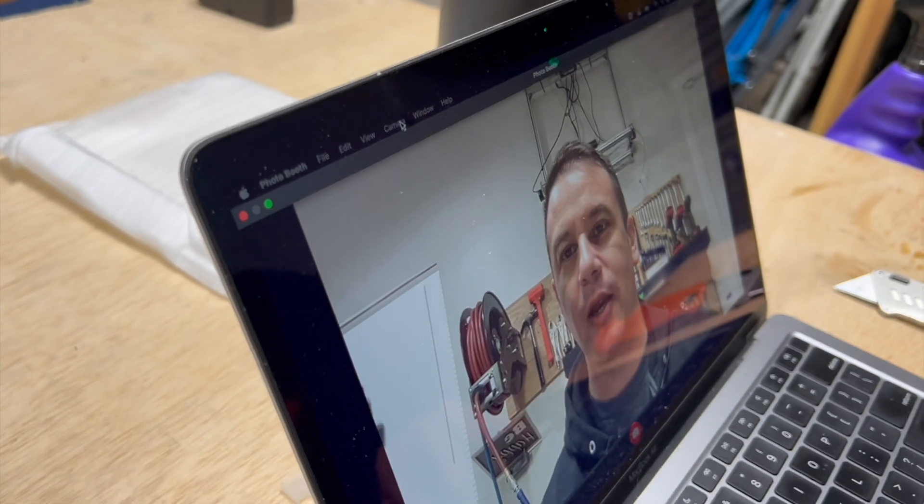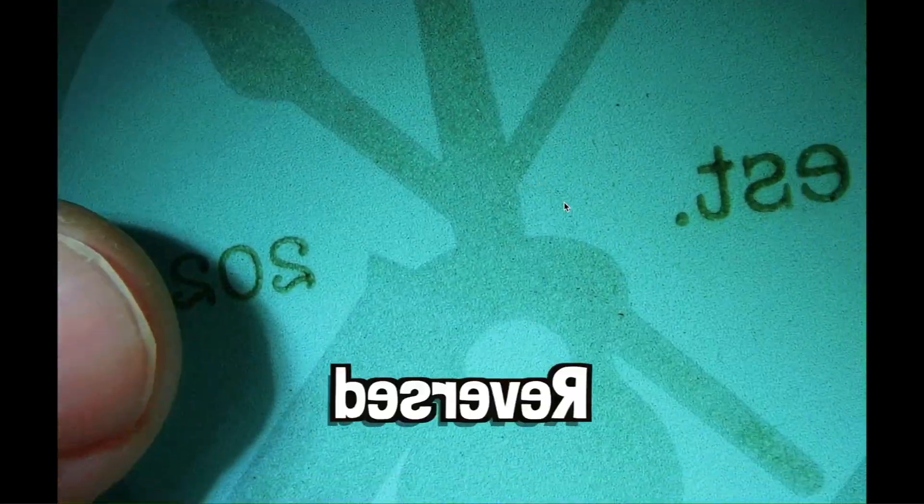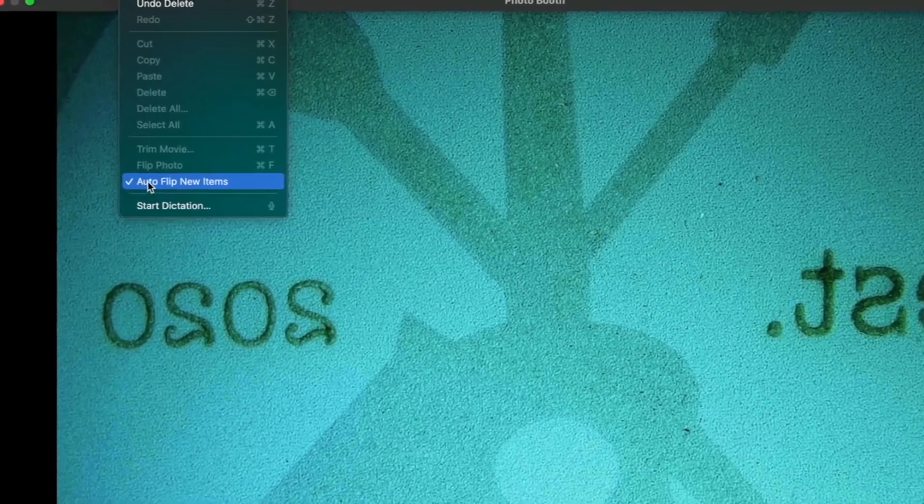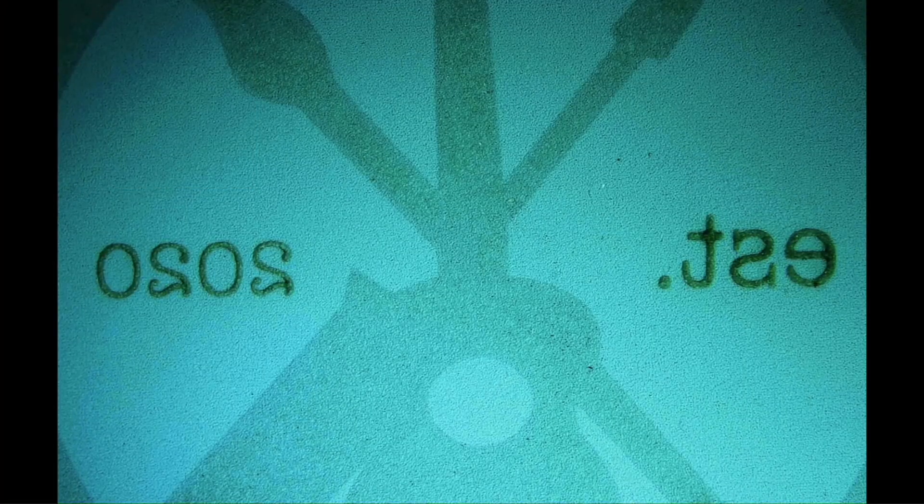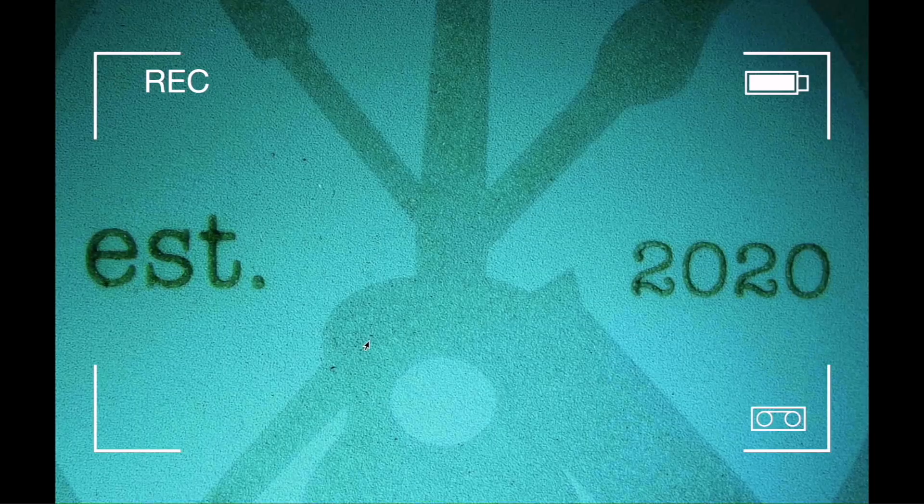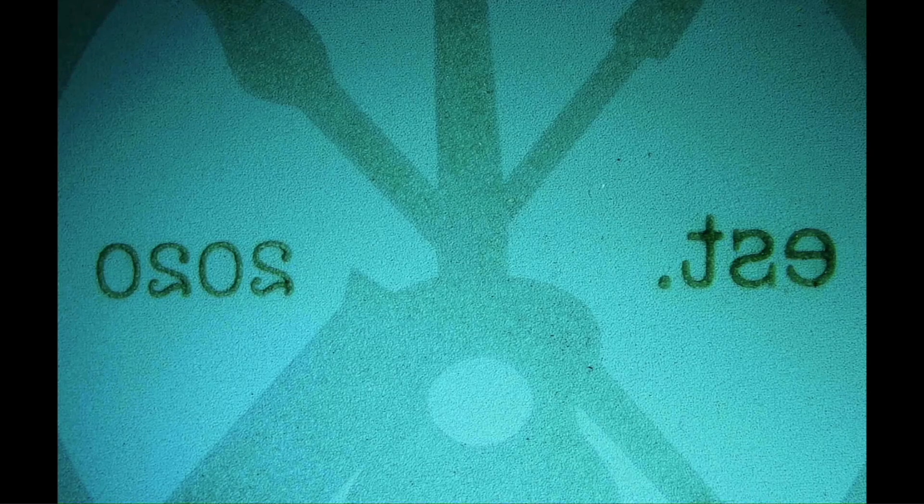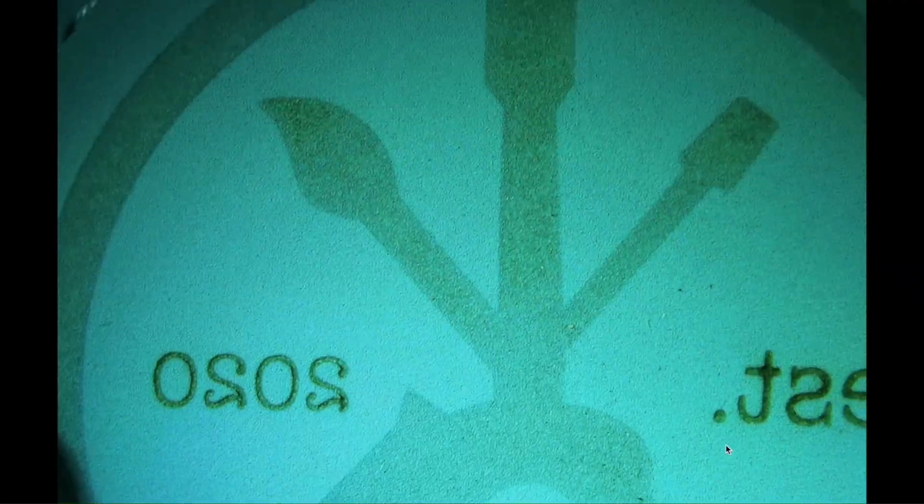And over here on our computer we're going to use a program called Photo Booth that comes pre-installed on every Mac. So we are here in Photo Booth, which is an application. It's right now using the camera that's in the computer and I'm just going to switch that to our USB camera if it picks it up, and you can see right here it did pick it up. So click on that and then here we go, there it is, and we can move around. Now you will notice this is reversed at the moment and that's something that we really can't get rid of until we actually record. But here in the settings we have auto flip new items. So basically when we record, if we switch this to a recording, when it saves that recording it's going to automatically flip it back.